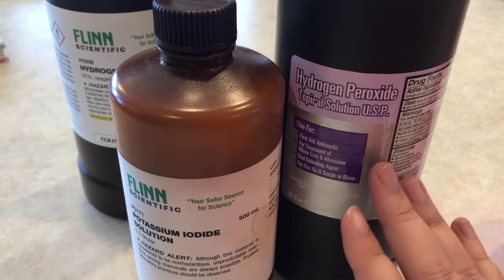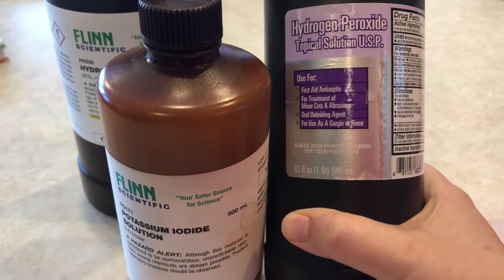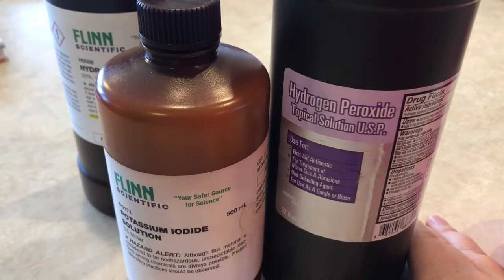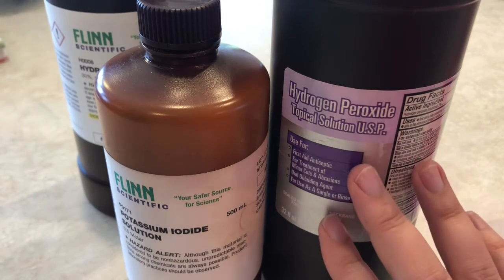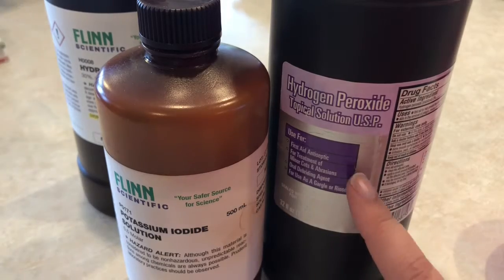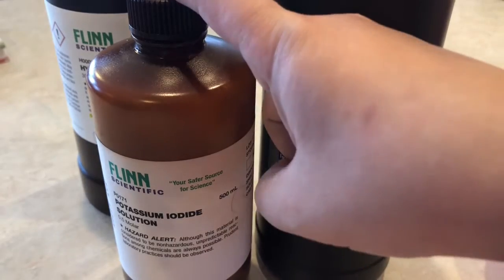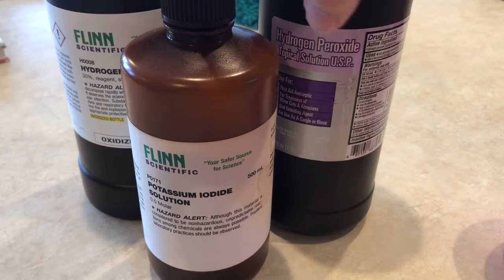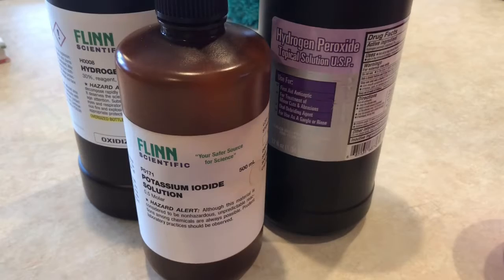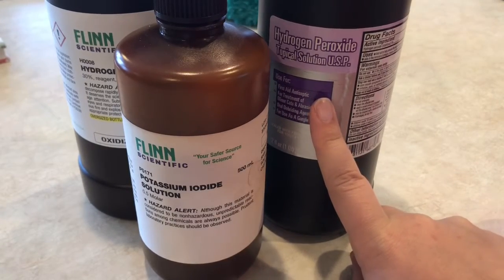But that reaction takes a super long time. You've probably had hydrogen peroxide in your cupboard at home for a while, and if you put it on your cut, it would still sting. So it takes a while, but we can make this reaction happen super fast by catalyzing it with potassium iodide. Potassium iodide is a catalyst, and a catalyst is just something that doesn't affect the outcome of a reaction, but just makes it happen a lot faster. So this potassium iodide is going to make the hydrogen peroxide break down really, really fast.